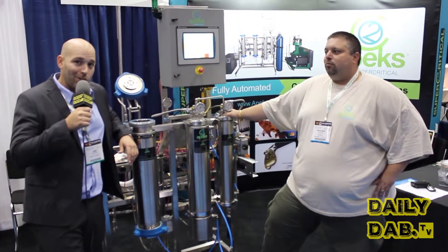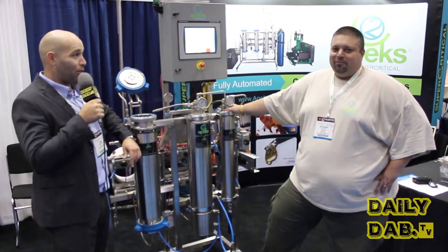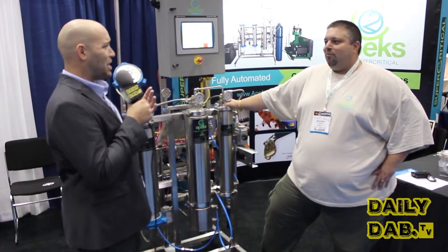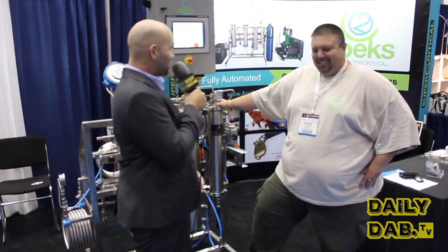Bill Nye the Science Guy needs to eat his heart out. Check this out — I'm with Apex. Look at this machine, this is a work of art. The Lamborghini of extractions. I'm with Sean. The Tesla of extractions.